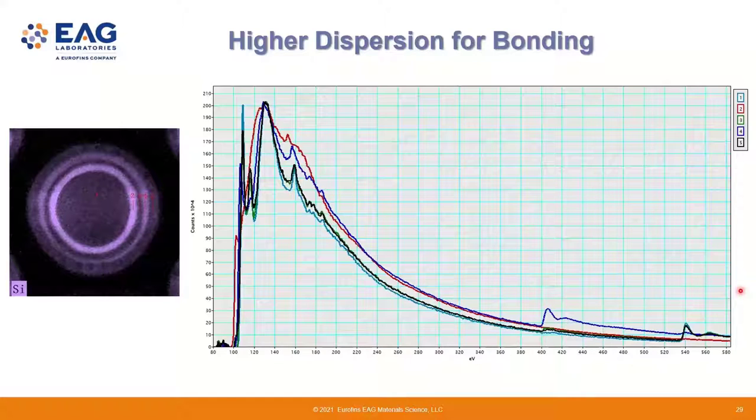Yeah, for sure. I'd agree. Whenever you're talking about energy resolution, you actually have to think about the fundamental features in the ionization edges that you're looking at, and then think about what resolution you need for the experiment, and not just assume that you always need something super high. When you monochromate, you make a compromise: you throw away signal, and the setup time is a little bit higher. So there's a trade-off.